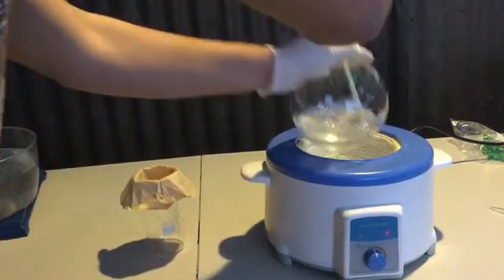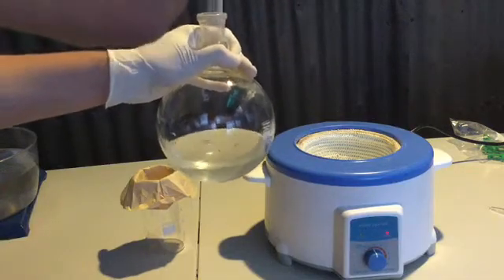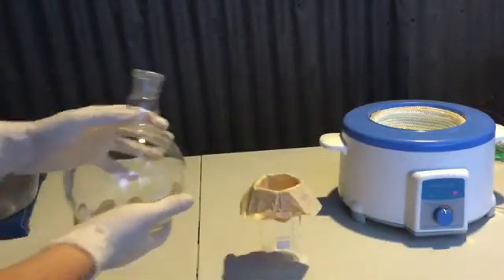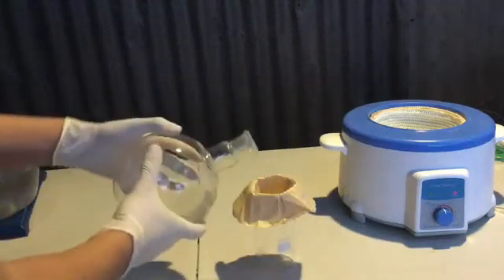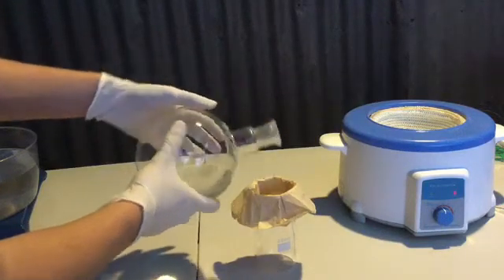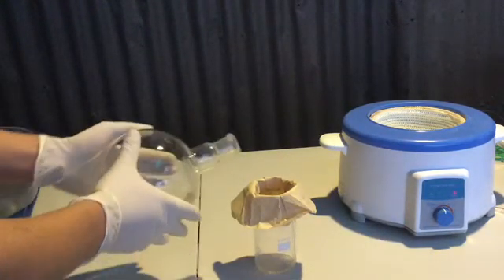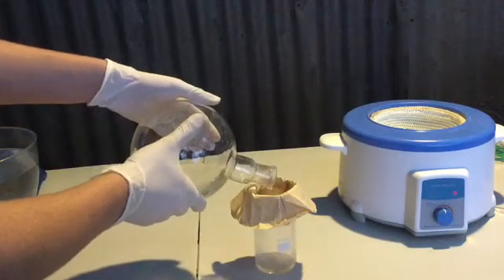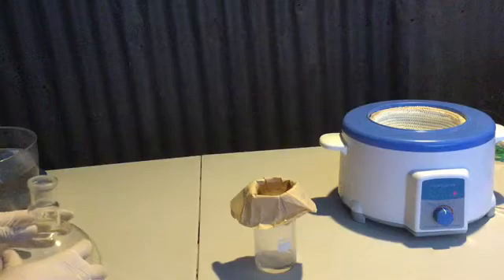Next, the hot solution was gravity filtered into a 300ml beaker using a low quality and possibly damaging filter paper. During the recrystallization process, a filtration step is not always necessary. However, since sodium hydroxide is highly soluble in water, it was thought that the less soluble and insoluble impurities would be partially removed. If you wish to perform a filtration before recrystallizing your compound, it is advised to lightly soak both your filter paper and receiving vessel in hot solvent, to prevent the early recrystallization of compounds on the filter paper or in the receiving vessel.